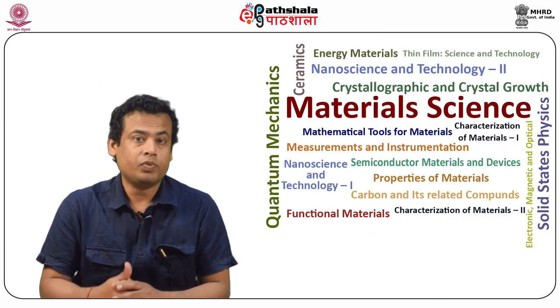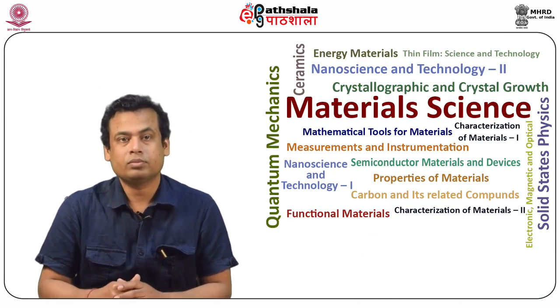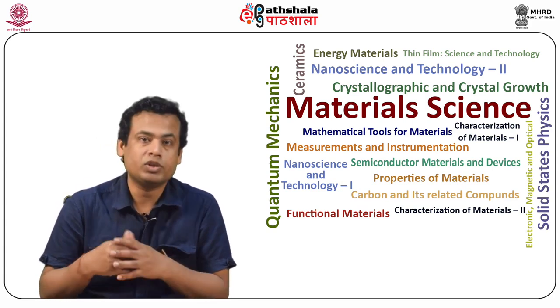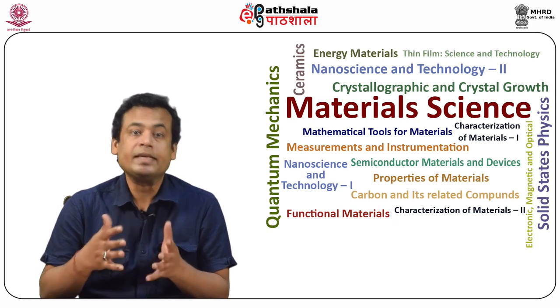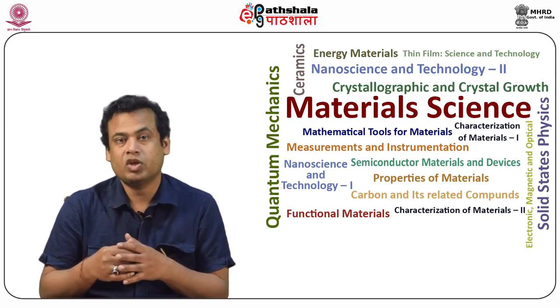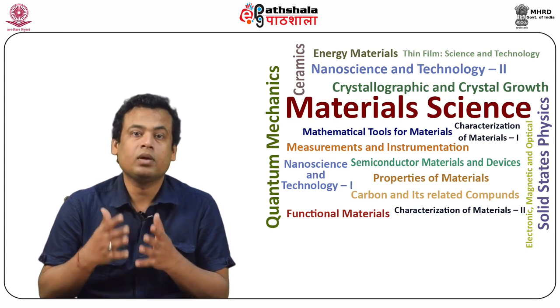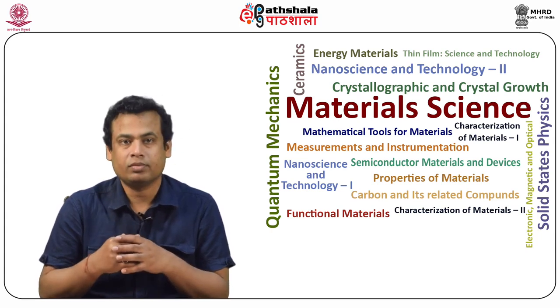The surface morphology and topography. Here, the morphology is a qualitative evaluation of the three-dimensional shape of a surface, and topography provides the quantitative dimensions to the feature.